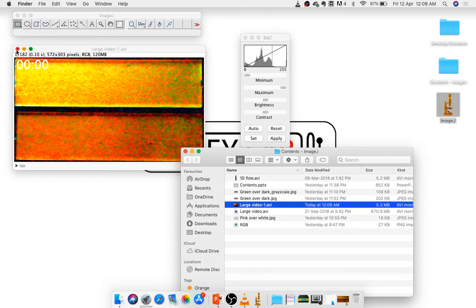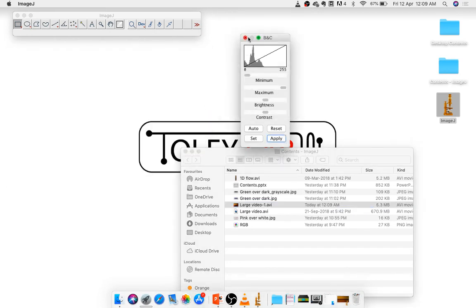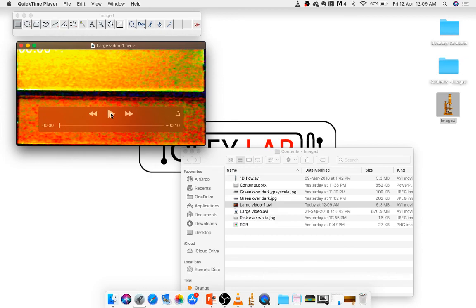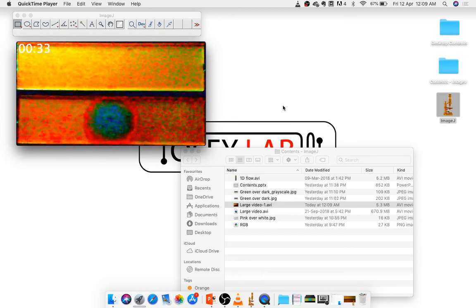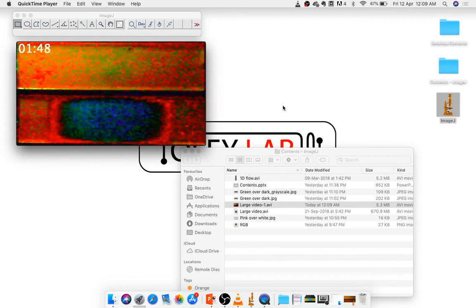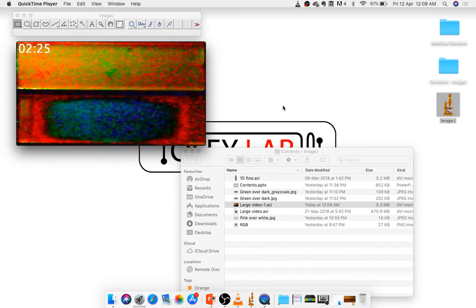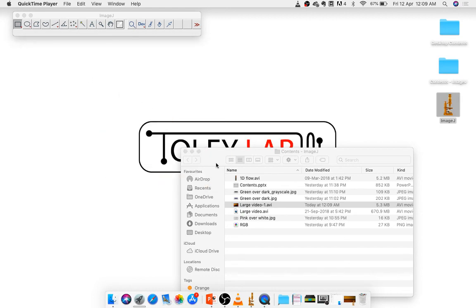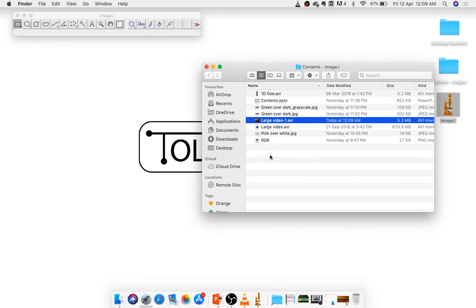Okay, so let's close all of this, and let's just play this video. It looks pretty good. It's about as good as you could have done with this video given the really dim lighting in this. Okay, so this covers many concepts, but I do want to enforce the brightness concept on you once more.